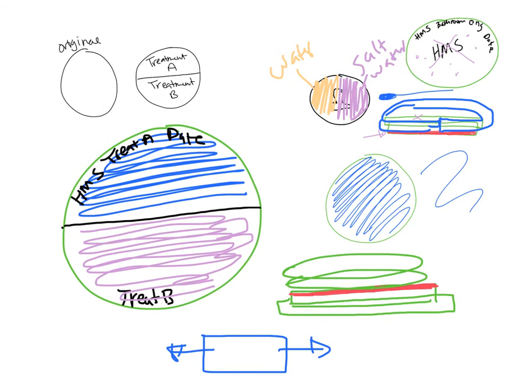All your swabs need to go in the trash can, and like I said, when you're plating, you don't want to open the plate all the way if you can help it, because that exposes it to bacteria in the air. And you also want to be careful not to crack them because they are just plastic. If you crack it, then bacteria from the environment will get in there and it'll mess up your experiment. Also, if you drop the plates, the agar can crack, just like if you were to drop Jell-O. It's a stiffer Jell-O, but that can break. And if that happens, then you're going to have problems as well.